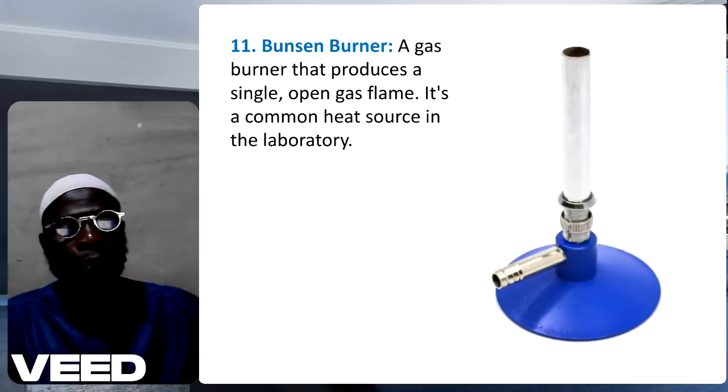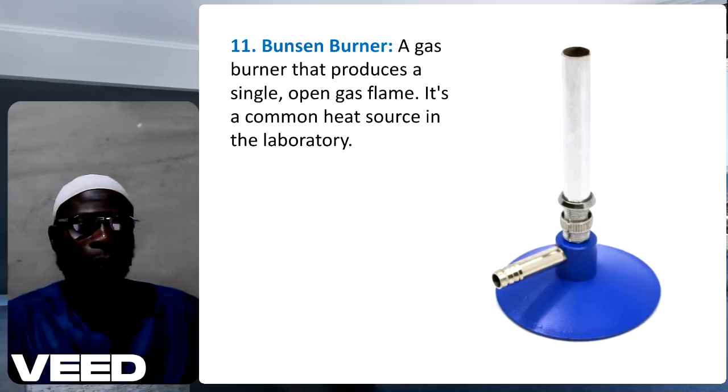So the next one is a Bunsen burner. So a Bunsen burner is a gas burner that produces a single open gas flame. It's a common heat source in the laboratory.